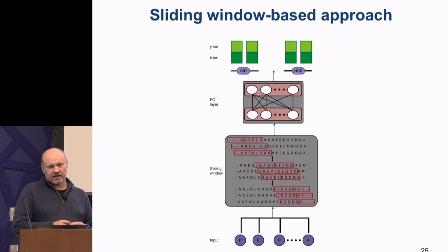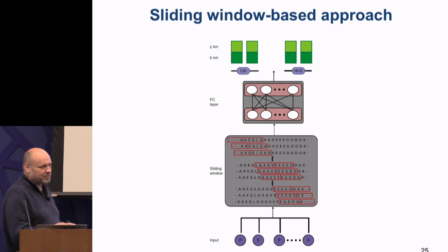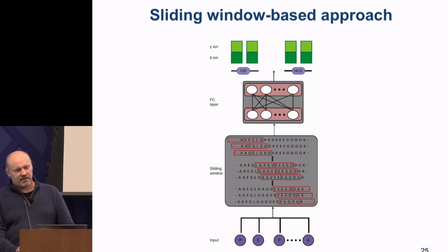But then we made another model as well. Why would we do that? We already have a model that's basically unbeatable. Why would we come up with another model? Well, maybe we can have a simpler model that is much faster to retrain, because training DeepMass at the moment with the 25 data sets already takes a couple of days on Google Cloud. And you can imagine if we integrate more and more data from PRIDE, that will take longer and longer, or more resources, however you parallelize it.